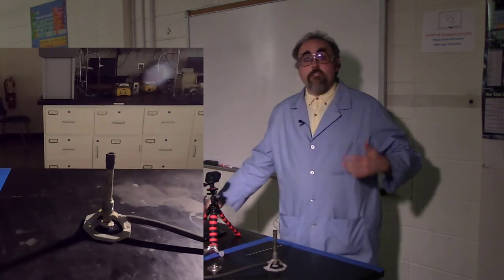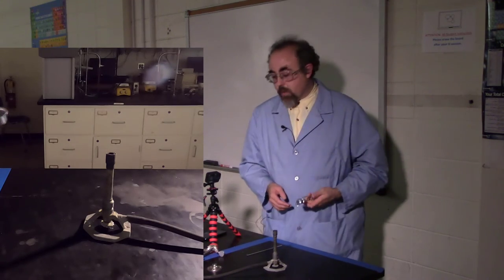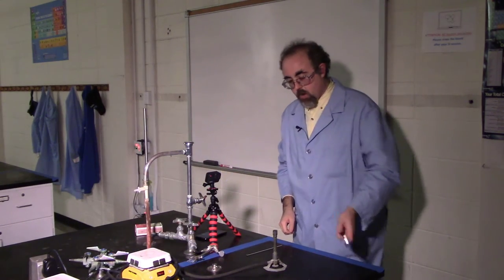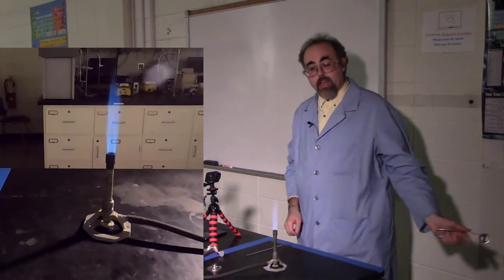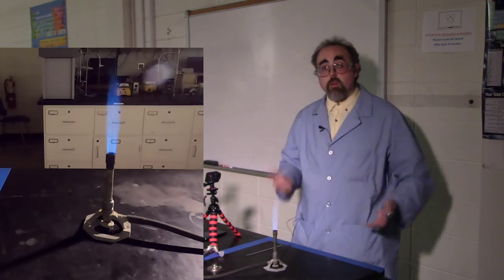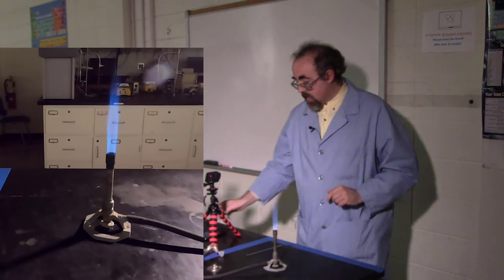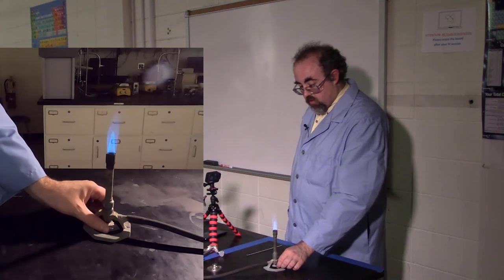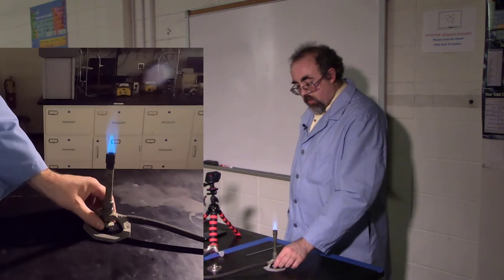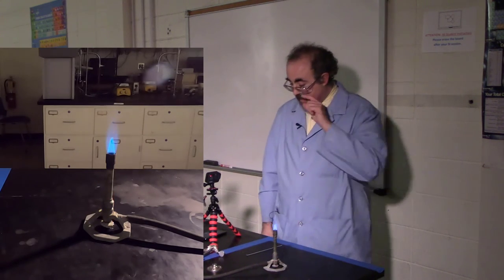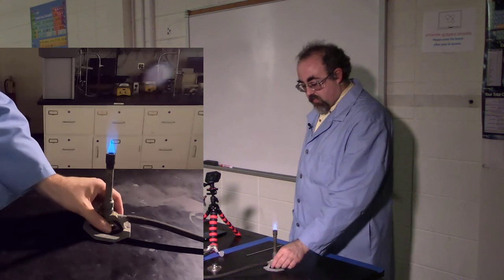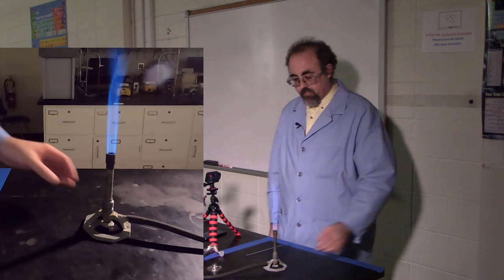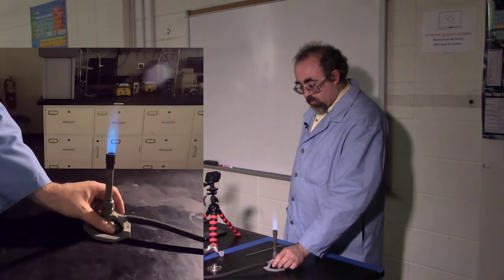So to turn this one on, first, I always want to have my ignition source ready. In this case, I'm going to have a striker head. And then I hover it over, and I give it a strike. And in reality, this is a beautiful flame. It's a little on the large side, but still a pretty good flame. Now, I can adjust the size of the flame with the control on the bottom. This gives me my fine adjustment. So I might very well want a slightly smaller flame, and this gives me a nice small flame. Obviously, I could go bigger. But once again, that's a little bit too big. That's a little bit of a safety hazard. So I'd like that a little smaller.